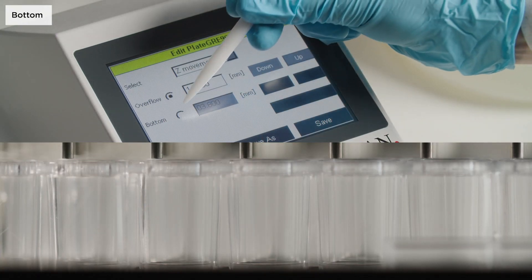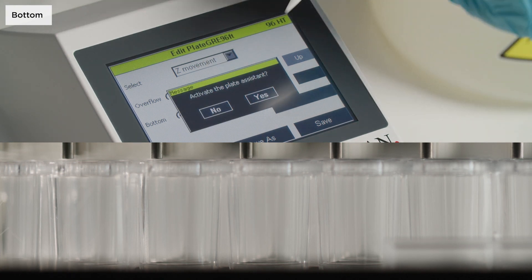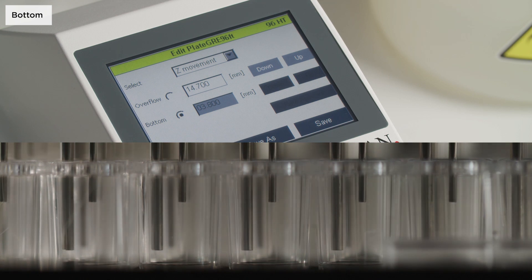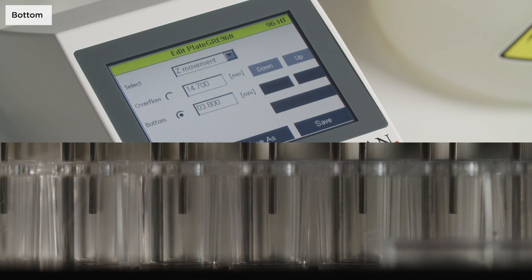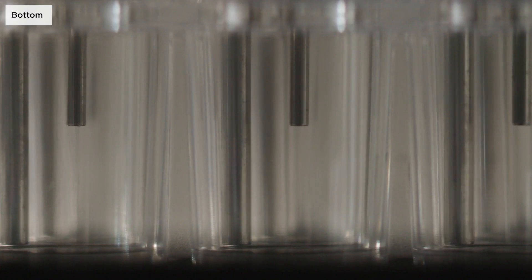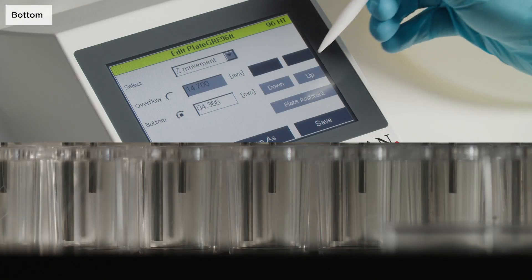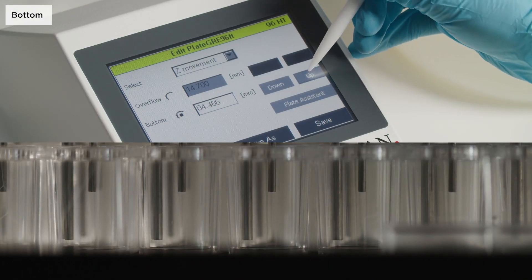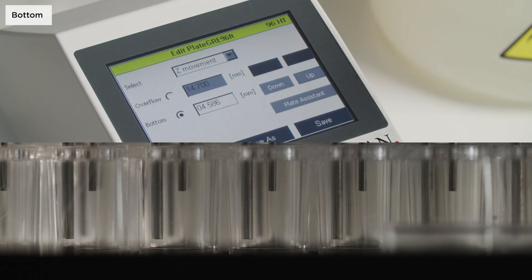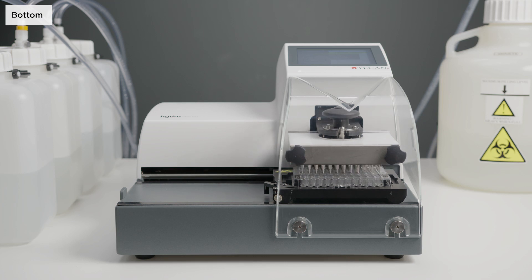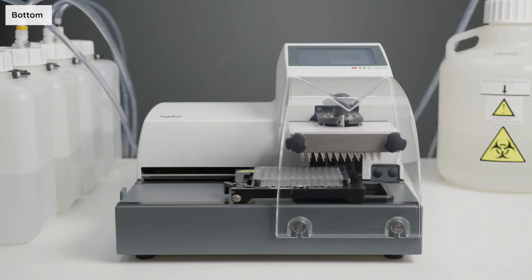When selecting bottom, the instrument will ask you if you want to use the plate assistant to automatically find the optimal bottom position. In order to do so, the needles will touch the well bottom, then retract and stop slightly above. You can verify this position but, in most cases, the bottom position needs to be further optimised by the user. The needle should be as close as possible to the bottom of the well, without touching it. The lower the bottom Z position, the lower the residual volume in the well.